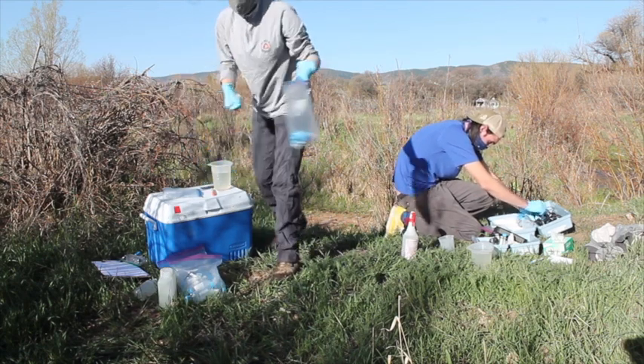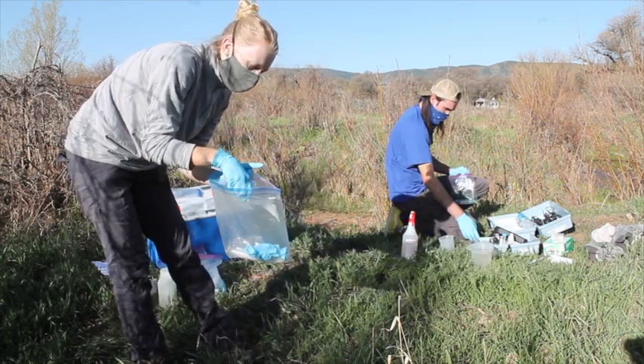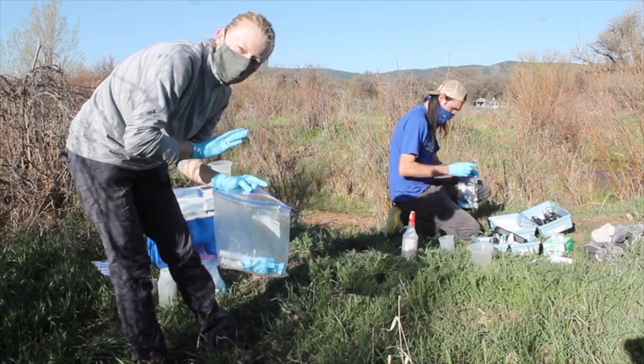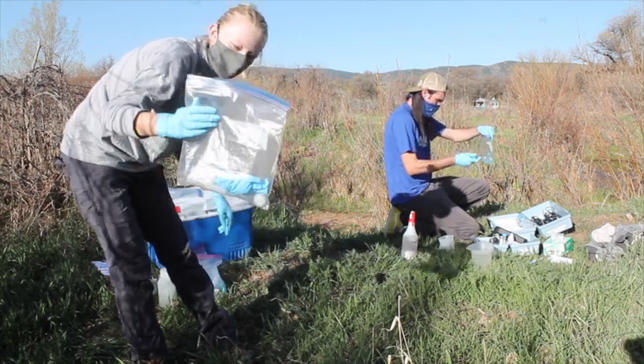It's good to bring a trash bag to make sure you don't litter. I'm just going to throw my syringes and filters back in here, since we're not reusing any of these at the other sites, and we'll keep this trash bag with us.